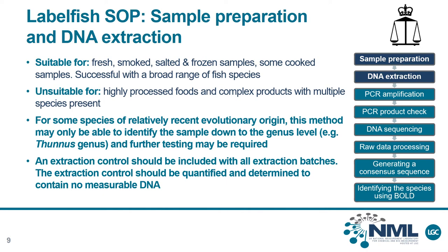The NanoDrop 2000 spectrophotometer provides quantification as well as an indication of quality, although other methods are equally valid. Regardless of the quantification method, the extraction control should contain no measurable DNA. Otherwise, DNA extraction should be repeated as contamination may be present.